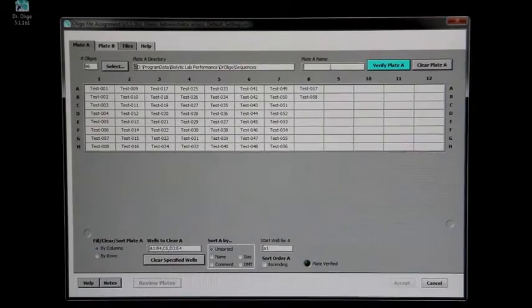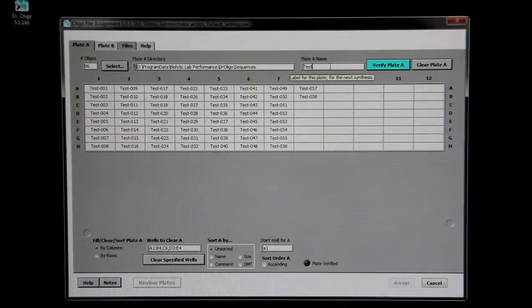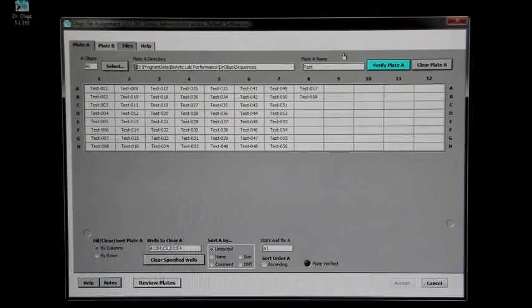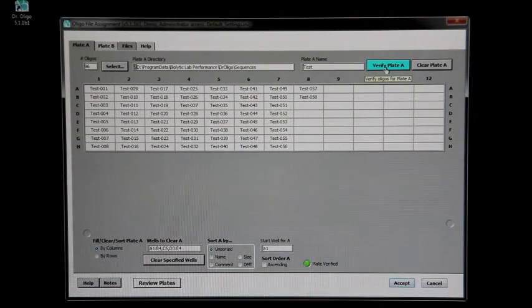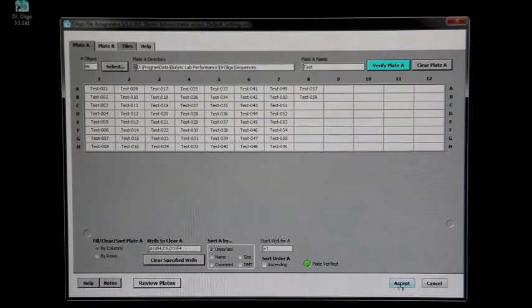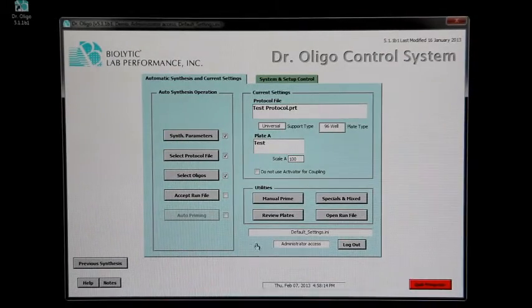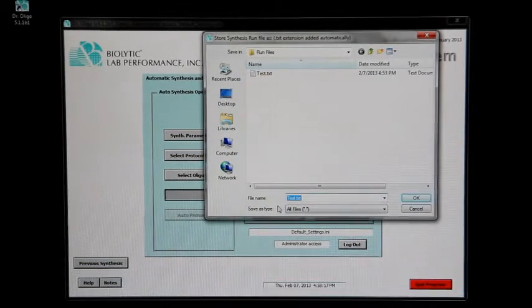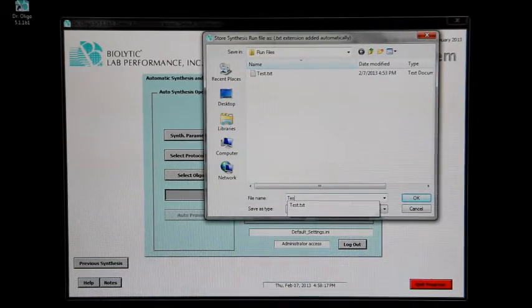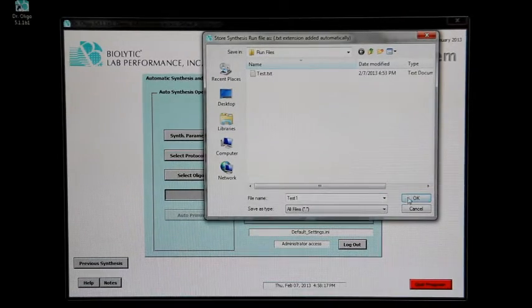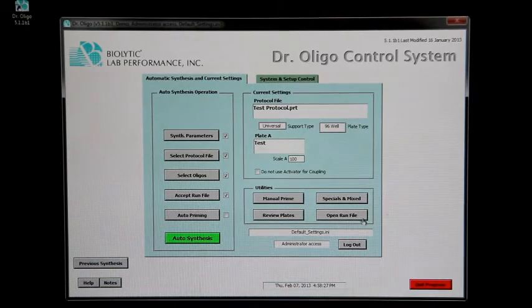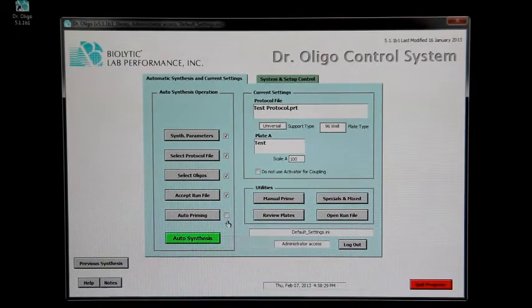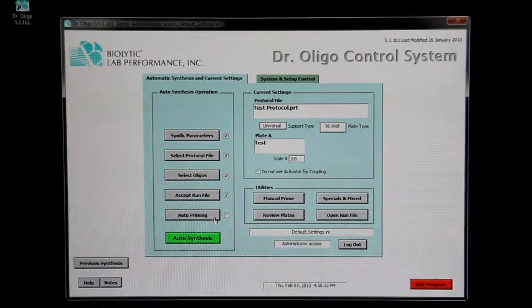The plate must be given a name, and the software must be given a chance to verify the sequences before you can continue. A run file will be created, collecting data from the run. At this point, it is recommended to prime all reagent nozzles, though this is an optional step.